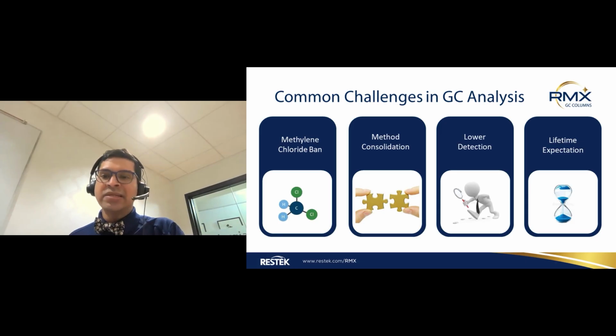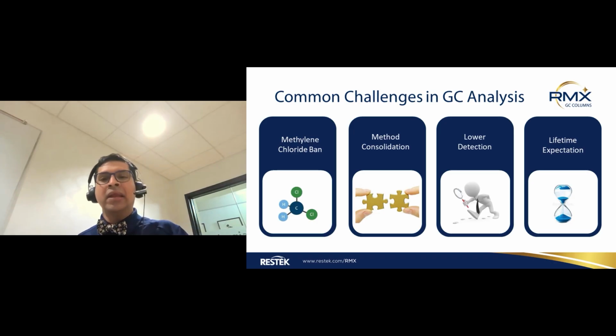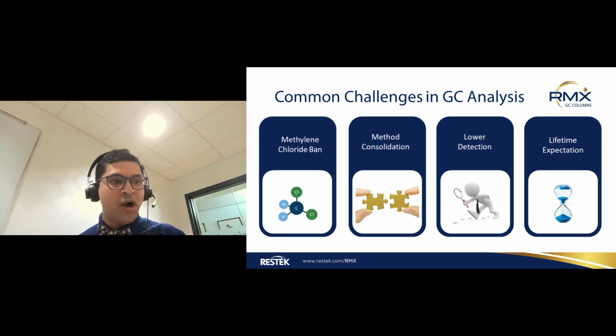Last but not least is also the lifetime of a column. Again, it's a very debatable topic when you talk about lifetime. It's matrix dependent. However, extending the lifetime and also having a column that's resilient to multiple matrices has a huge impact on the lifetime of the column and also on going high throughput and saving cost per sample.